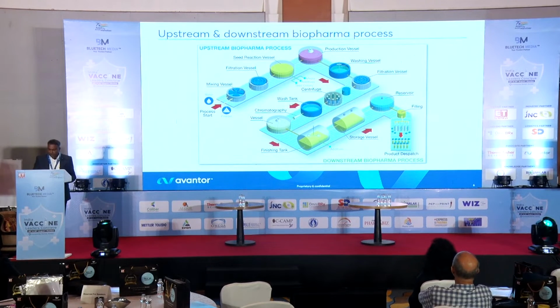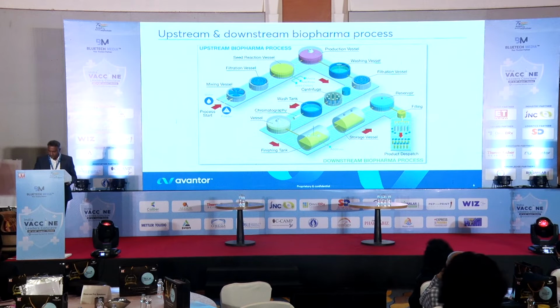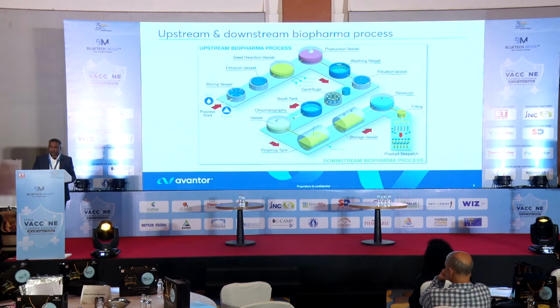Of course, throughout this typical workflow, a lot of things are involved, like valves and tubing, then sensors and definitely pumps. This is typically what enhances the fluid handling solution. Because of the various reagents or media to be moved throughout the workflow, and the different requirements at each stage of development, selecting the best product is always a very involved process. In fact, I would say there are key drivers that make your process better.